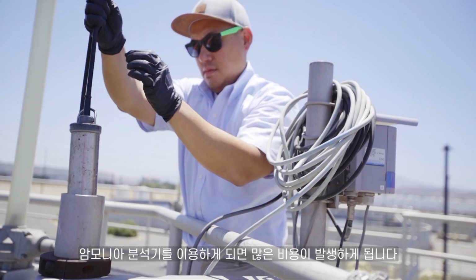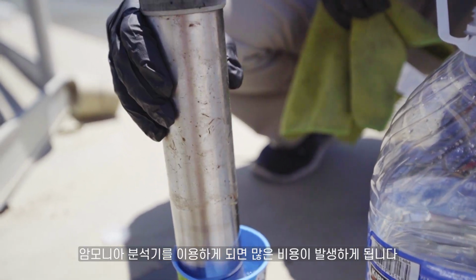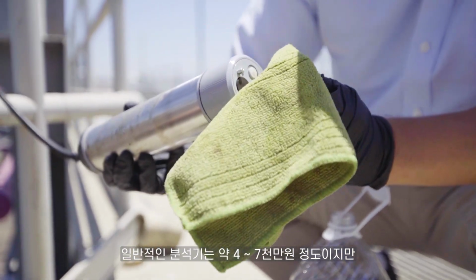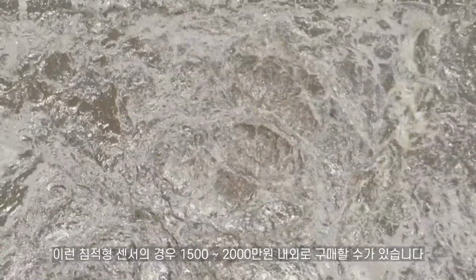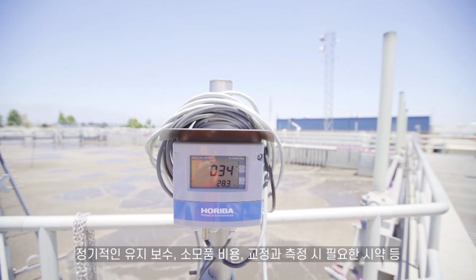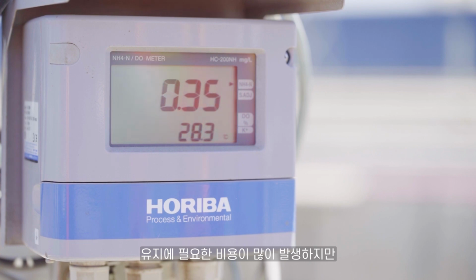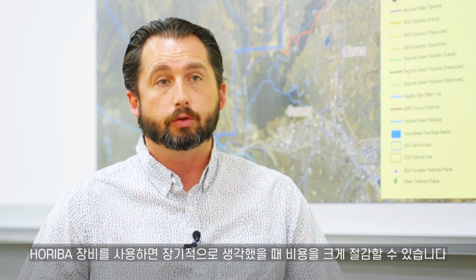The expense that comes with doing nutrient control is, in order to do that, you have to get a wet chemistry ammonia analyzer, and those analyzers are in the neighborhood of $30,000 to $40,000, where a probe you could potentially get in that $10,000 to $15,000 range. So it's a huge cost savings from an O&M perspective, on not only the upfront capital, but the routine maintenance that is required to keep these things up and going, calibrated, and whatever miscellaneous consumables you may have in a wet chemistry analysis.